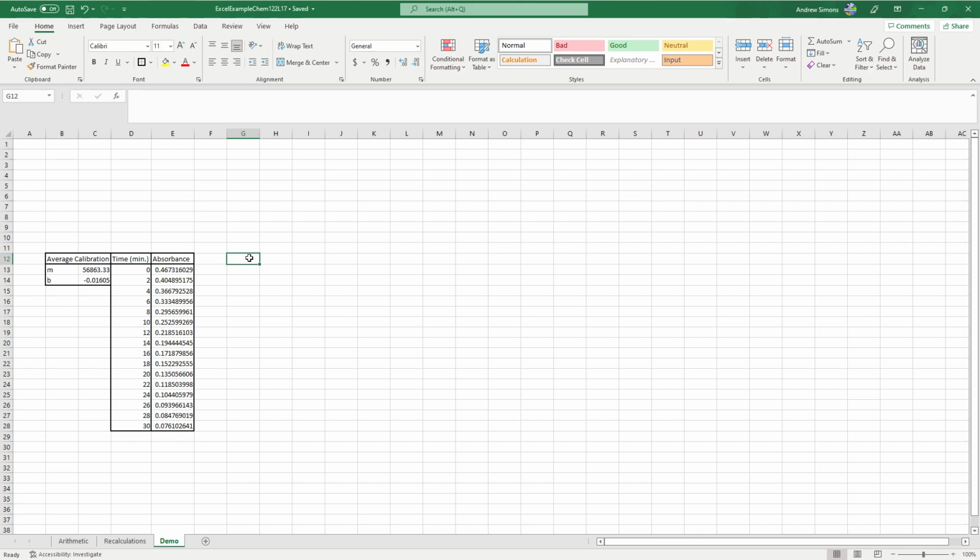I'm not too concerned about how you guys are going to set that up, because really the only part of this that I need to see is the graph. So as long as you get to the end and get the K value that you need, everything should be fine. So, all right, getting started.